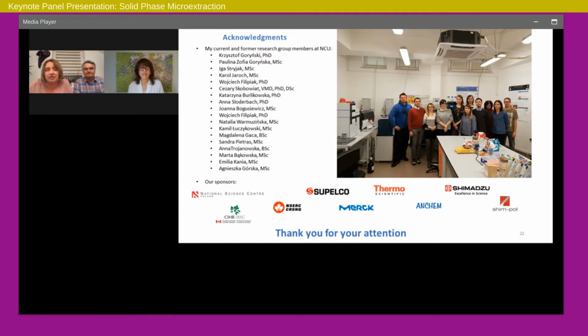So clinicians are really happy with the technology. So we basically work with many groups, especially surgeons, but not only. But I think that, well, right now there is only one company which provides the biocompatible fibers. So that may be one of the problems.